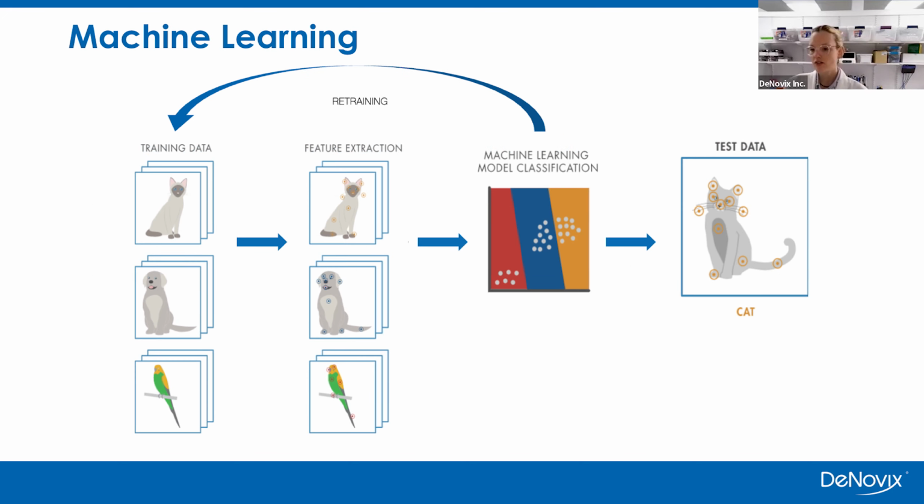A bit of background on machine learning in case it's new for you. We took image sets and we told the software what class each object is to be in. In our case, whether or not it's an organoid, dissociated object, or debris. We'll get an initial algorithm that is not perfect. It is then corrected by a scientist using different sample types and different conditions. So we're retraining it over and over and over until the algorithm results are accurate for the application.